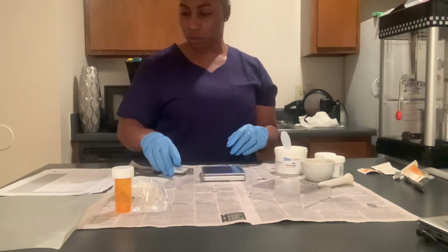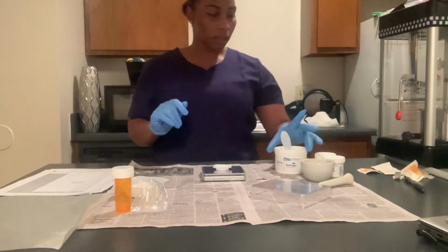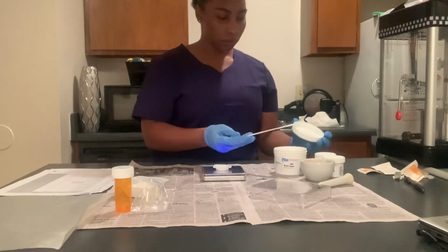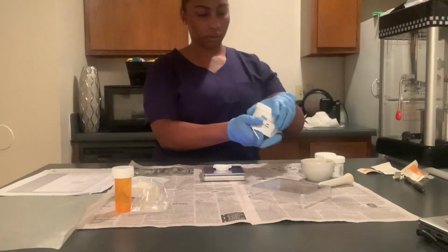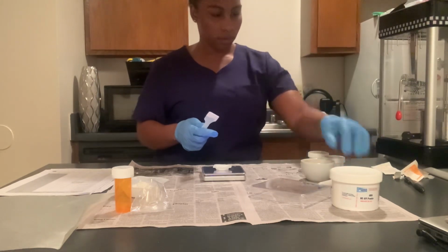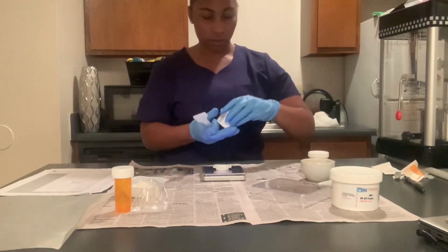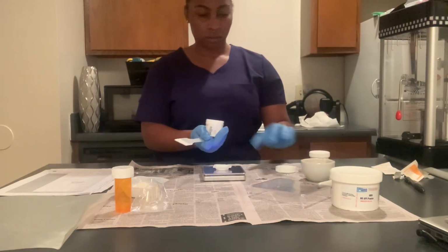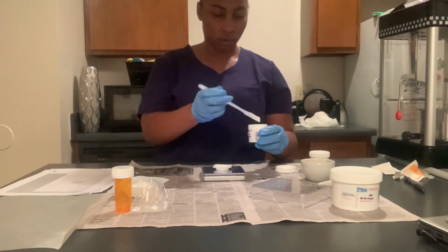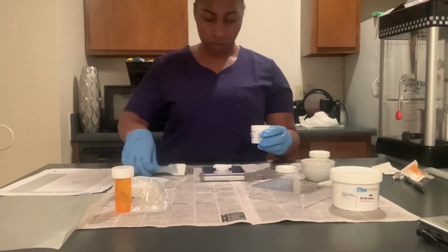And now we're going to do caffeine, which is 1 gram. So I'm going to put this weighing boat on there. So for caffeine powder, remember, put it to 0.